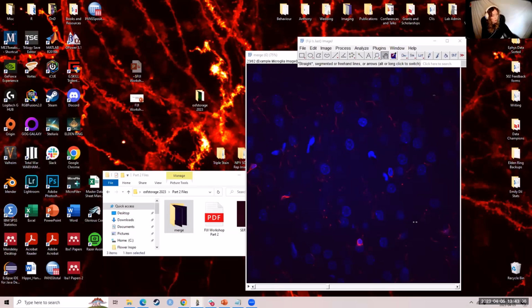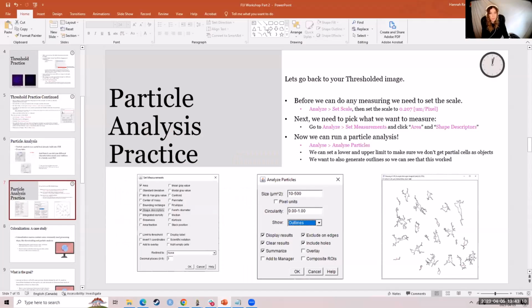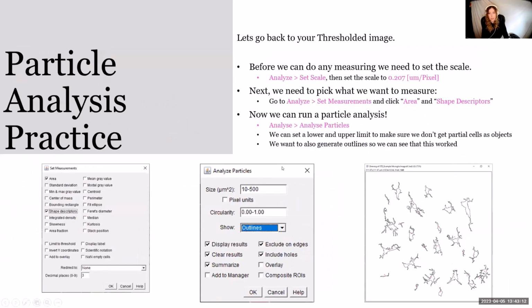All right, that's been another 2 minutes, so I'm going to go ahead and move on for now. For people who have gotten to their binary option, and people who haven't, you can keep working on it. And then we can run Analyze Particles for those of you who have gotten to your binary image. I see that one person in the chat saying it opened individually. Can you tell me exactly what it is that you tried that made it do that?